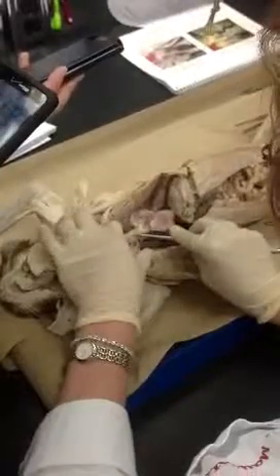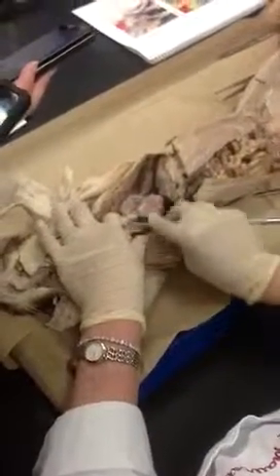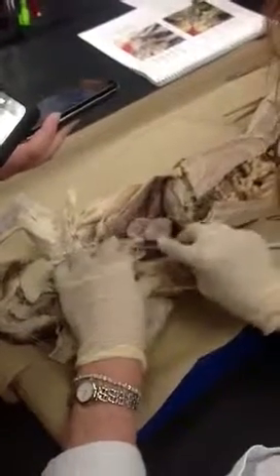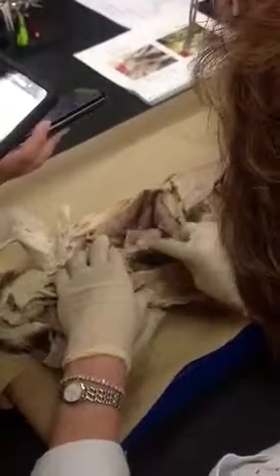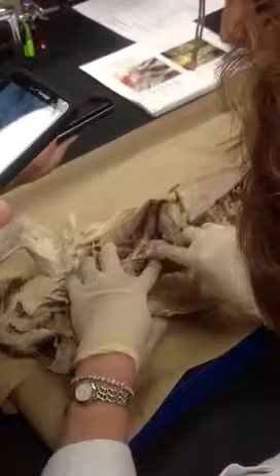So we've got this gorgeous thymus and everything up here. We can kind of pull that out of the way now because we want to see these. Now this one doesn't have a whole lot of red here, but you can still kind of tell it's red. All right, so all I'm doing is here's my pulmonary trunk and my aorta. Here's the aorta coming up and over. There's the pulmonary trunk. There's the aorta.